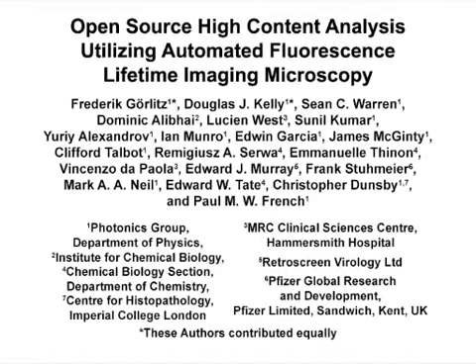The overall goal of this procedure is to demonstrate how to implement time-gated fluorescence lifetime imaging microscopy, or FLIM, in an automated multi-well plate workflow using open-source software and basic instrumentation. This methodology can be applied to FLIM-based readouts in assays of fixed or live cells and is particularly useful for reading out cell signal processing of protein interactions.